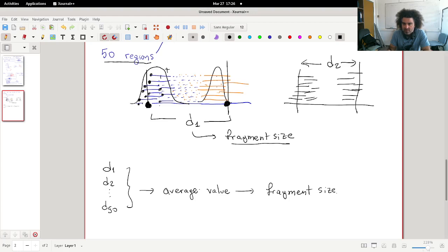And what it takes is the position of these reads, not the beginnings, as I said previously, but the position that corresponds to the highest value of this distribution. It's not super important for us. In any case, it follows this procedure that is not so difficult to demonstrate, that it finds the location of one peak and the location of another peak, and the distance between these two locations is called the fragment size.